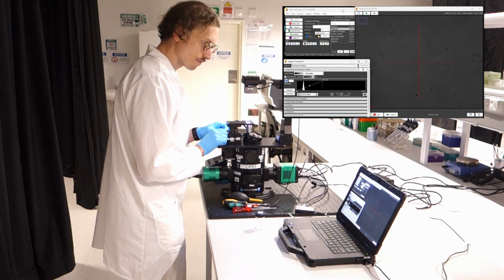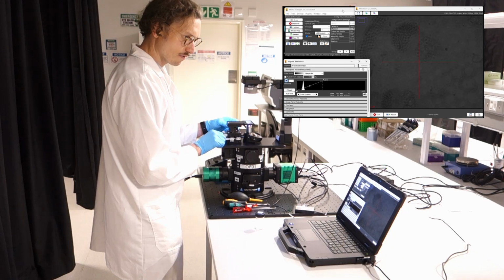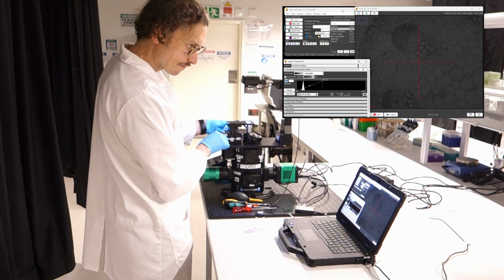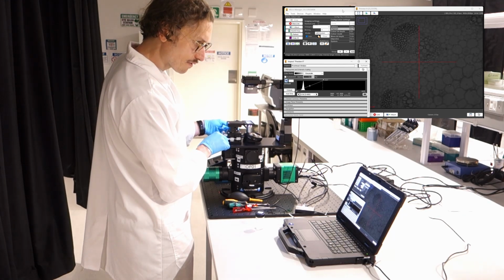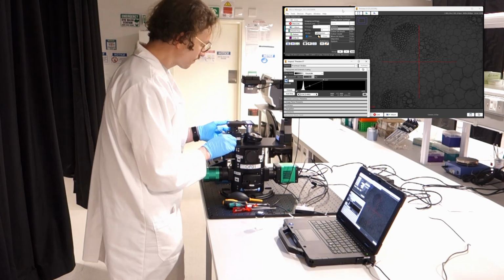Once you've adjusted the exposure and the sample becomes visible, use the X and Y micrometer knobs to move the sample laterally. Bring the sample into focus by carefully rotating the Z focus knob. Do not allow the objective lens to contact the sample slide.